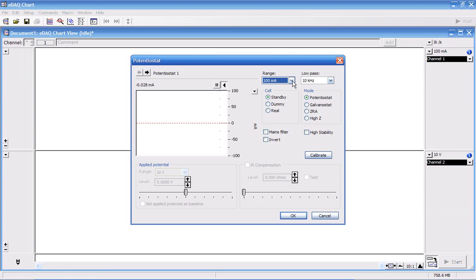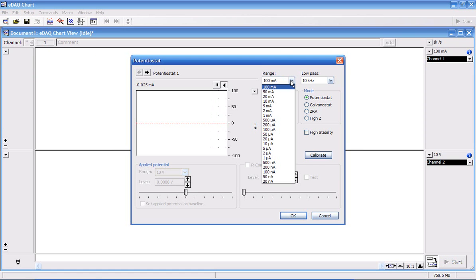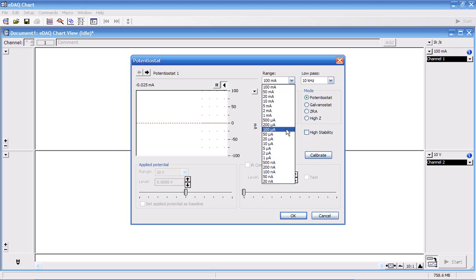You can start by choosing the range for the current in here. For this example, I'm going to choose 100 microamps.